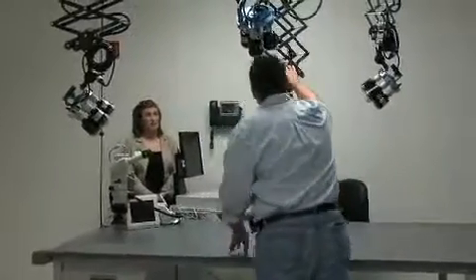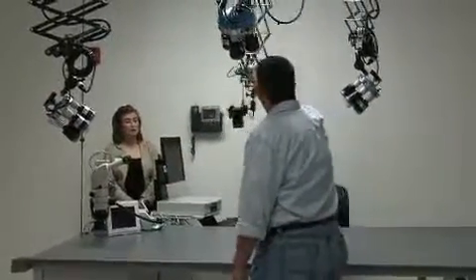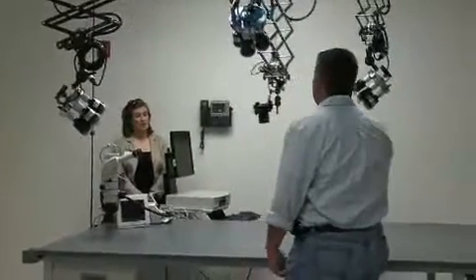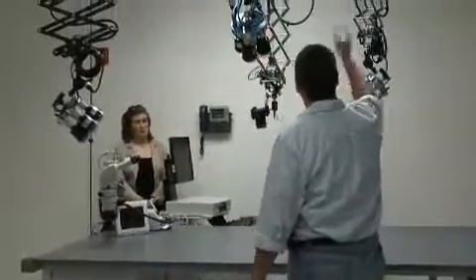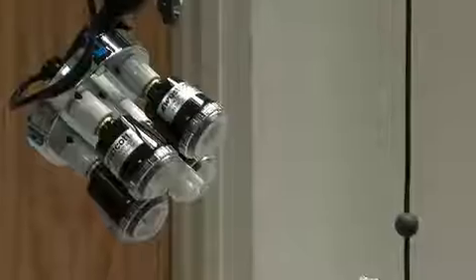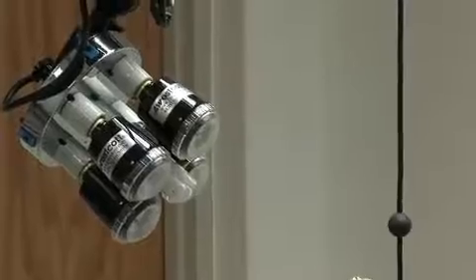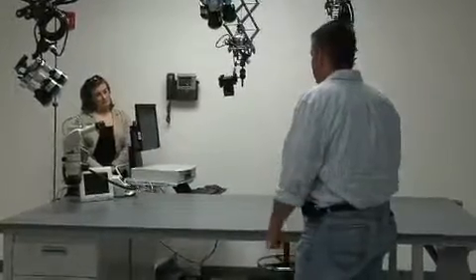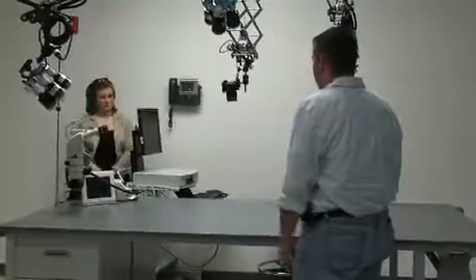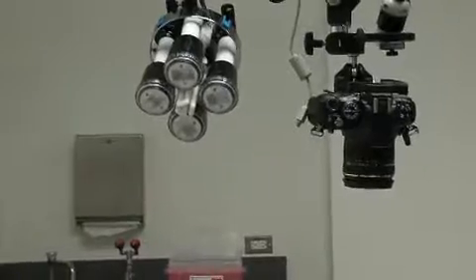And these are actually on rollers, so the entire system rolls from side to side, and then the cameras will roll forward and back. And then all the lights are the same way. They're on individual rollers, so we can adjust the lighting, adjust the camera exactly like we need it. Then we can take the picture of it. It stores the image in the computer. We can put it out to our network, go back out to our work queue and pull that image up and import it into our case notes if we want to.